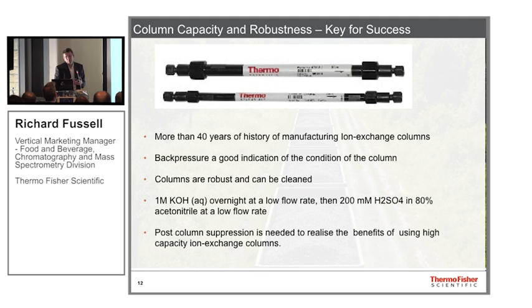And also the post-column suppressor is absolutely necessary in order to get the benefits from using these high capacity ion exchange columns. But you can also clean the suppressors should they get contaminated. We need to do that very infrequently.